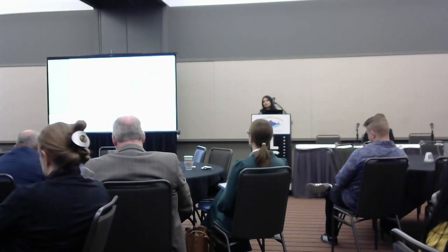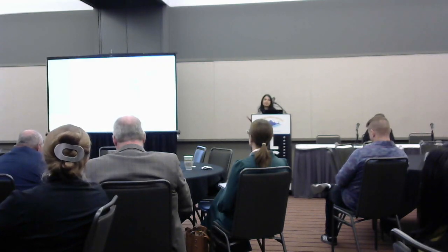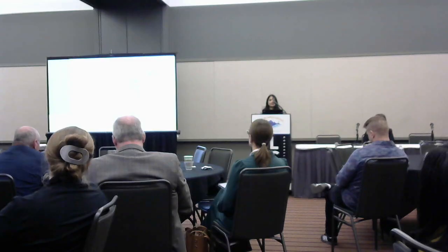So for our microscopy core, we do have an association directory. It currently has 5 terabytes of space, but with our light sheet, we're actually going to increase it to at least 20 terabytes, so we can deal with multiple light sheet files.